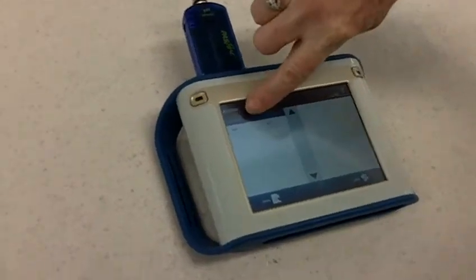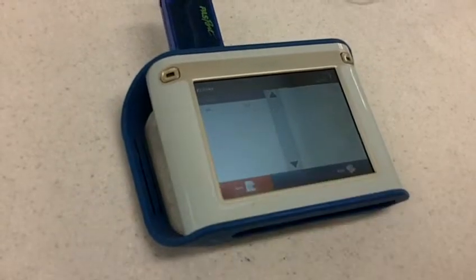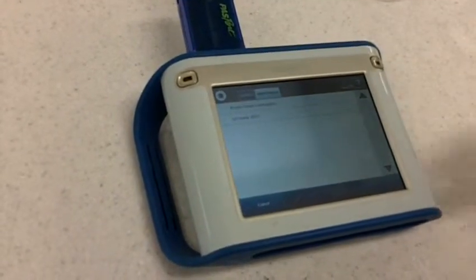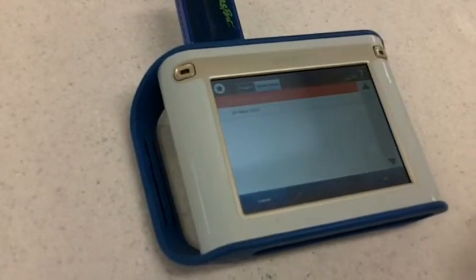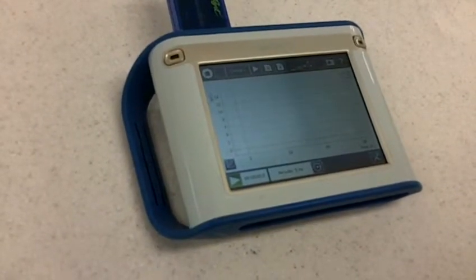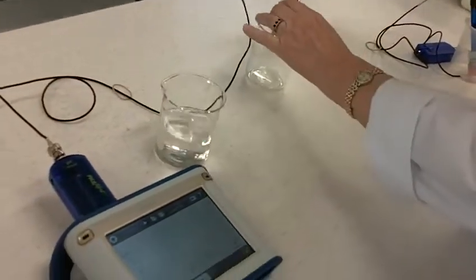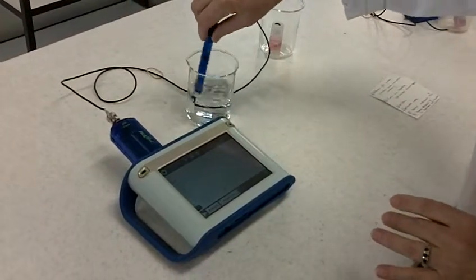The pH sensor should appear. Tap on Open, tap on Saved Work, tap on Brushy Creek Investigation. Now we're ready to take our reading.